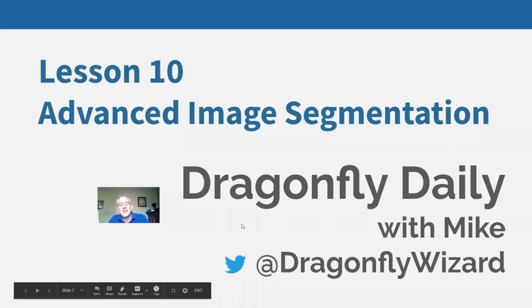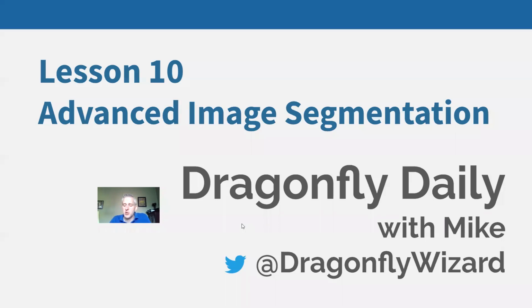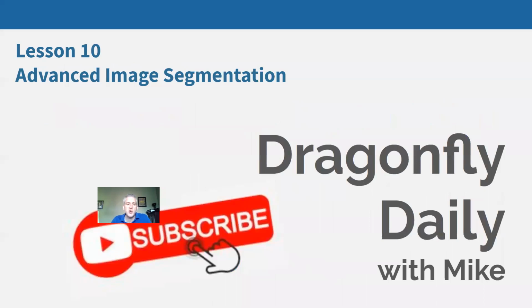Today's lesson, lesson 10, advanced image segmentation. So we're going to build on what we did in lessons 8 and 9 on ROI tools and ROI Painter. Those are the region of interest tools for labeling the different regions of materials or particles or whatever it is you're interested in your image.